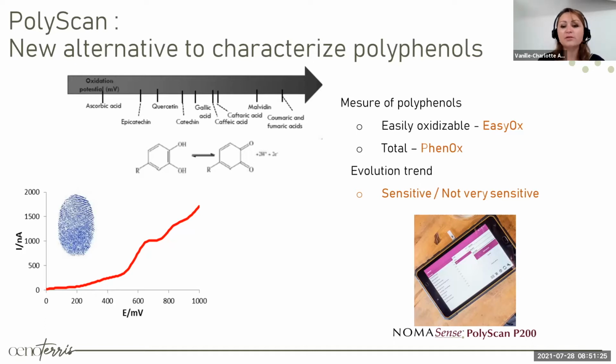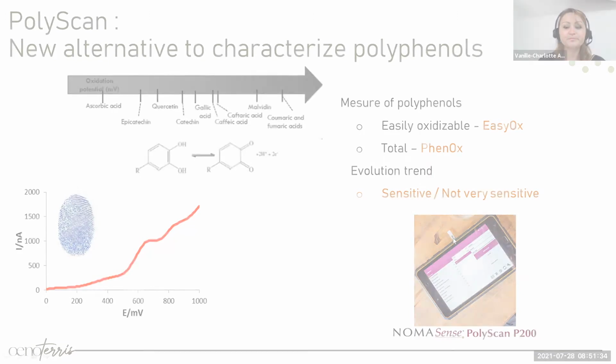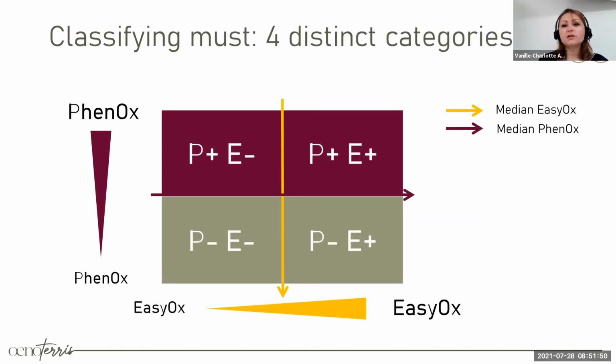So you just collect the sample in the tank and then take a drop and put it on the strip right there, and then do the measurement and you're good to go.